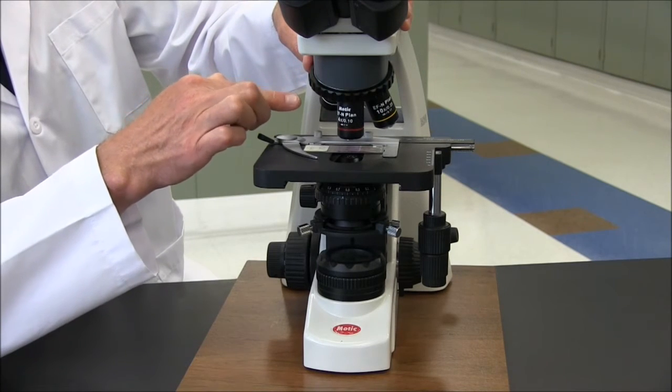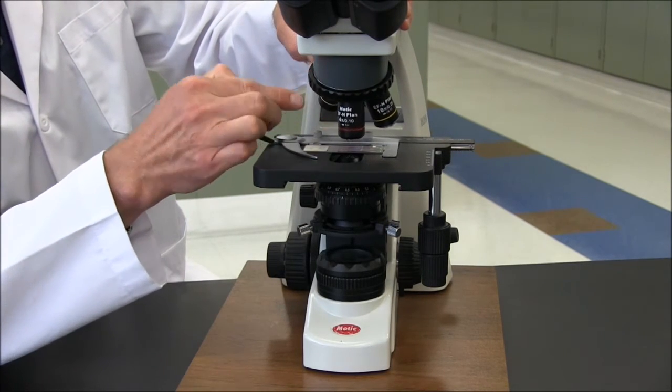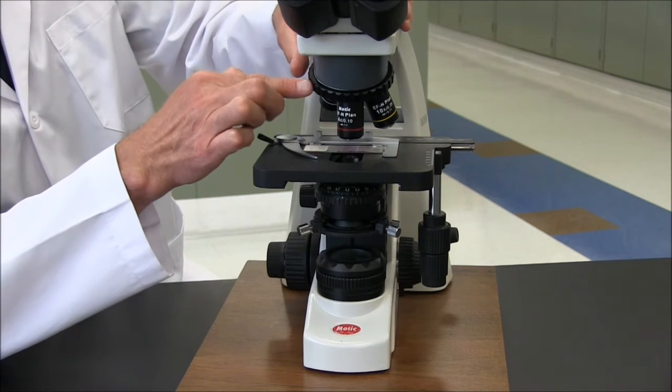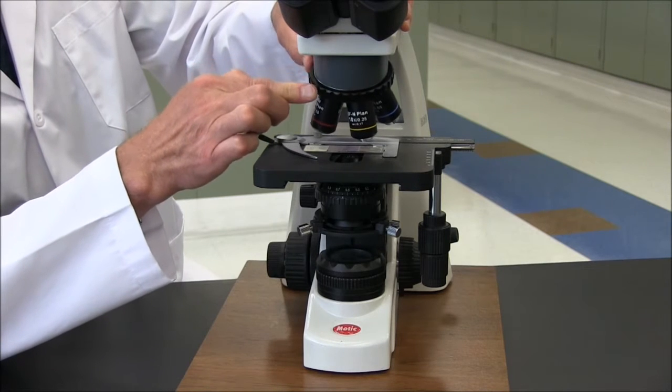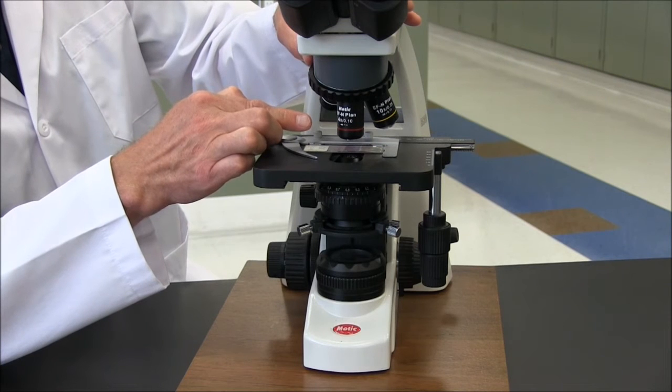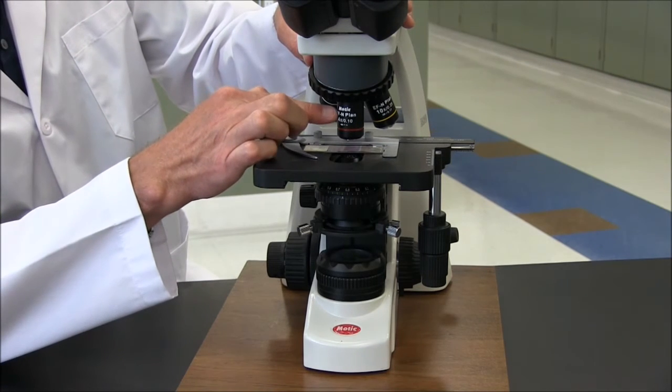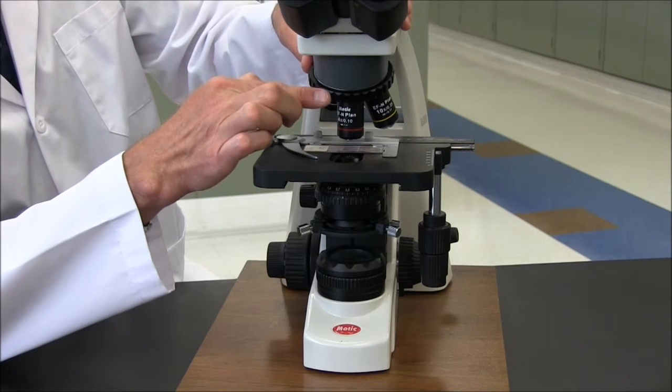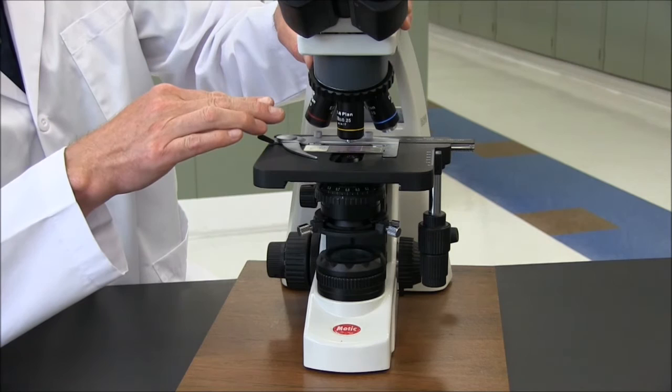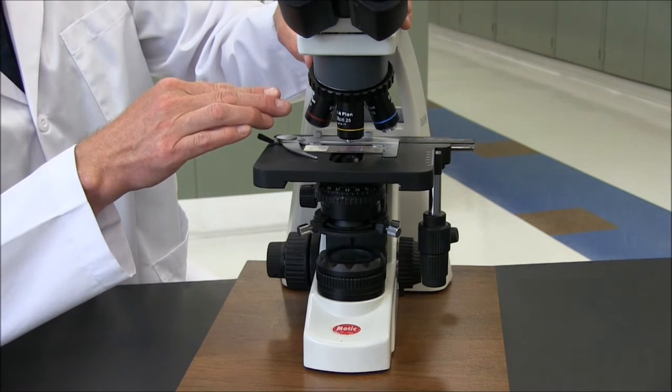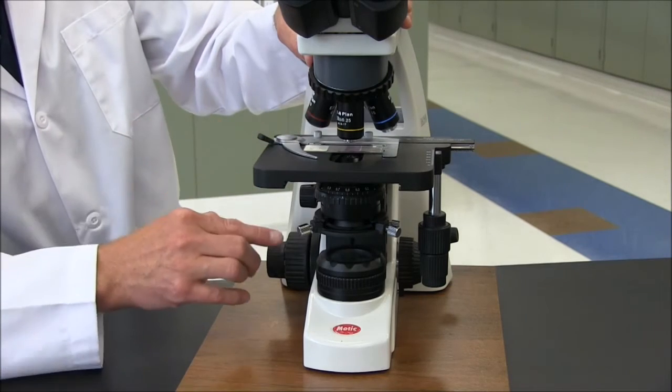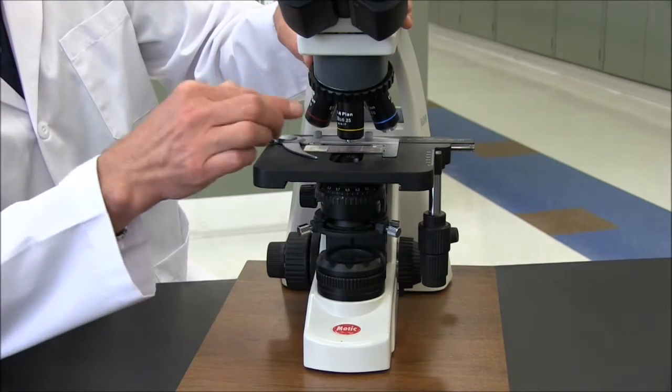When moving between objectives, you don't want to use your fingers to push on them because they may become misaligned so that the beam of light doesn't go directly up into the objective. You always want to rotate them using the revolving nose piece here. These objectives are also par-focal so that when the 4x is in focus with this slide, and you want to change to the next objective, the 10x, you don't have to lower the slide and then bring it back up into focus. As soon as you rotate the 10x objective into place, you just have to do some fine focusing and you should see the image clearly.